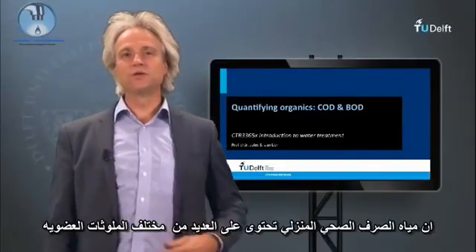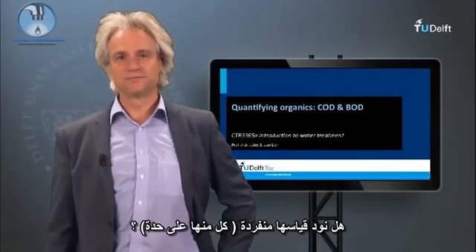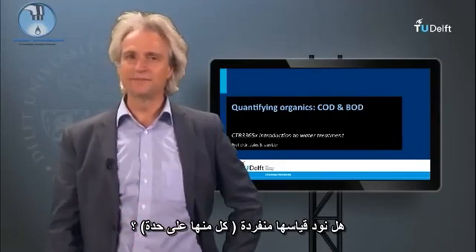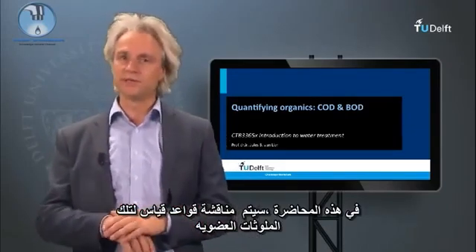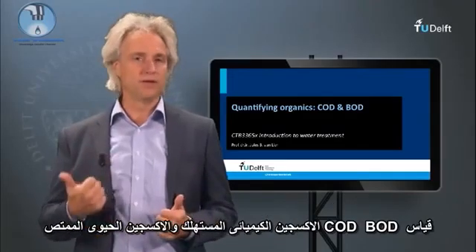Many different organic pollutants are present in domestic sewage. Do we need to measure them individually? In this lecture, the basics of quantifying organic pollutants will be discussed, the COD and BOD measurement.